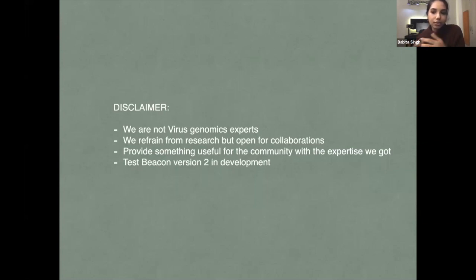I will show you later also. So we are open for collaboration. We would be happy to collaborate. And if you have ideas, for example, our intention was to provide something useful for the community with the expertise that we have, but not to hinder the research that is going on.